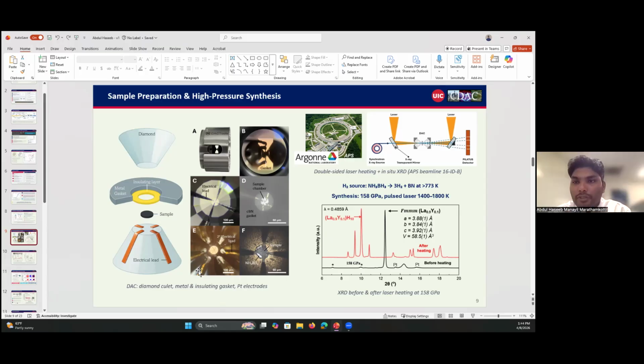We are using 2 micron thick platinum foils, so we don't see much change in our experiments. We had used multiple techniques before, with PVD, FIB, etc. We see better results with the hand-placed platinum foils, 2 micron thick.